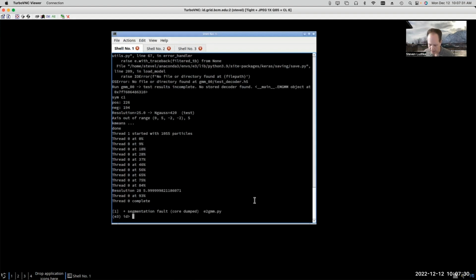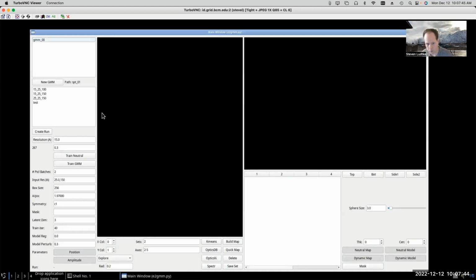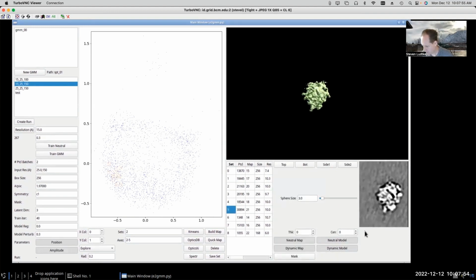So in addition, and of course that happens unfortunately occasionally, and I haven't figured out exactly what causes it. Sometimes as you're rapidly switching back and forth between the 3D models, something happens with the isosurface generation and it crashes on you. It won't lose anything. We can just go back exactly where we were again. It's just an annoyance. Anyway, so back to what we were doing.